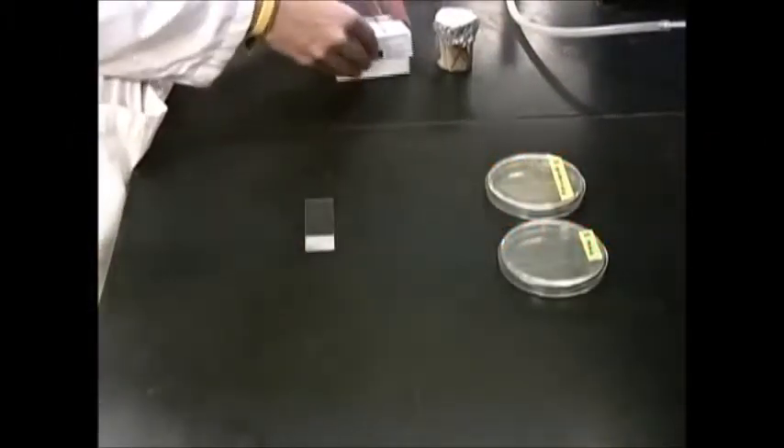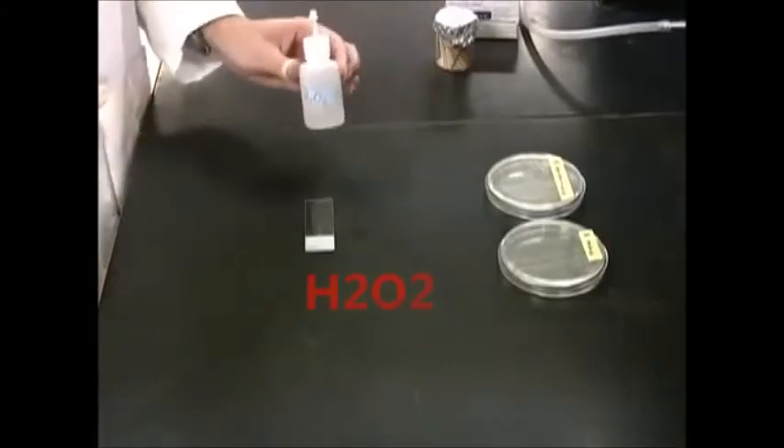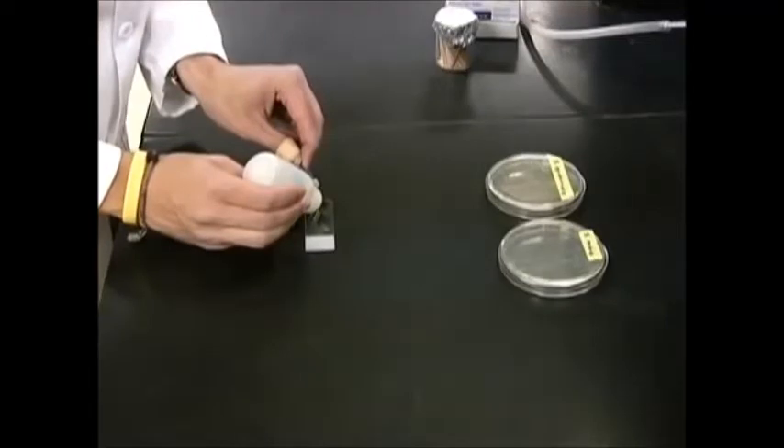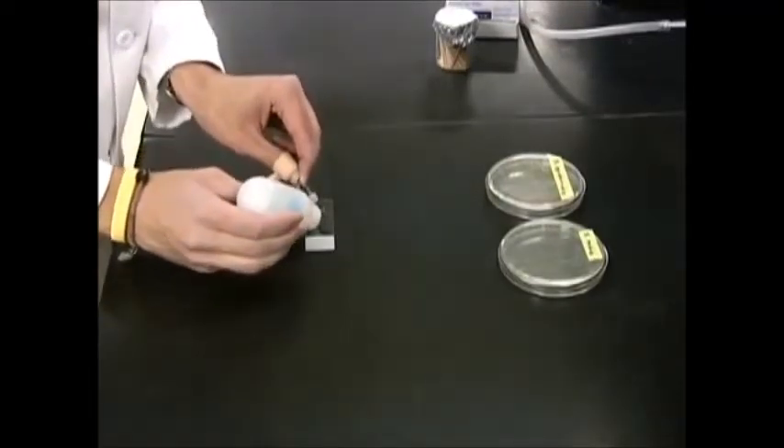To perform the catalase test, place a clean glass slide on the lab bench. Take a bottle of hydrogen peroxide and place two small separate drops on the slide.